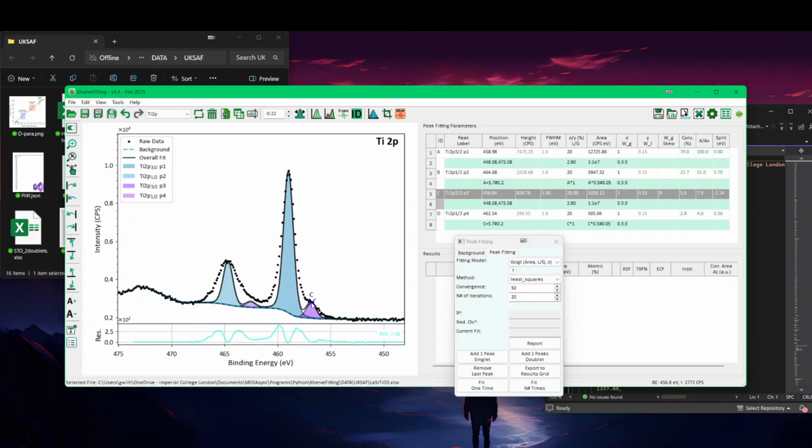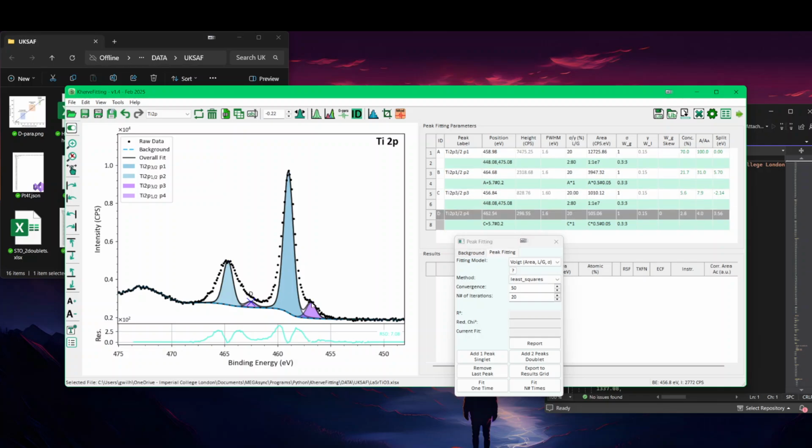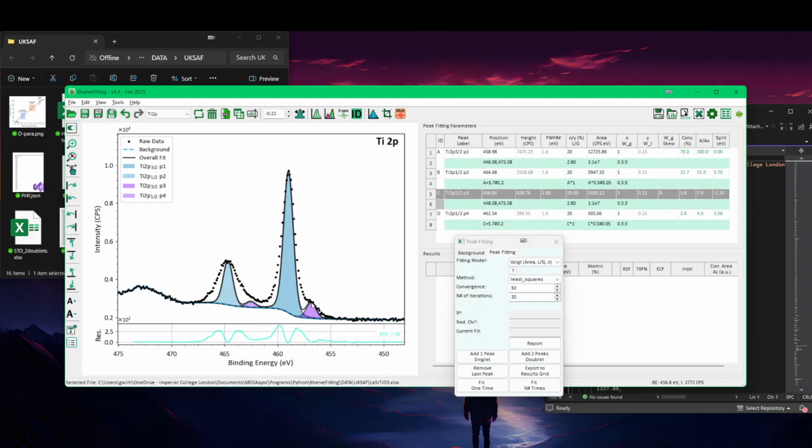You can also use the Alt key. The Alt key allows you to do it manually. So if I do Alt up, because maybe you have to click on the Alt like this, Alt up. So now you can see it going up. You can see it going down simply by using the Alt left or up or down key. I prefer simply to use the mouse, but let's say if I have a trackpad, that's maybe the best one.